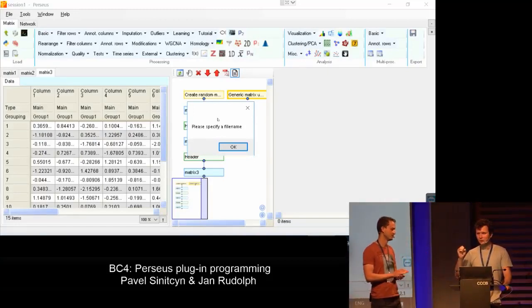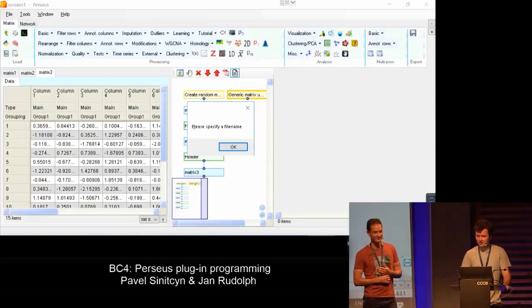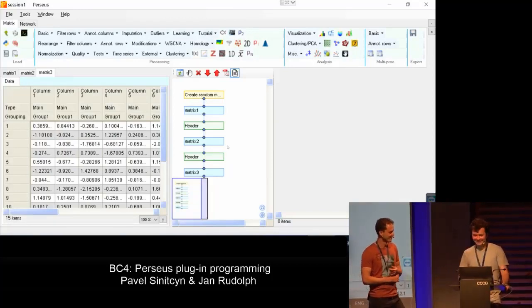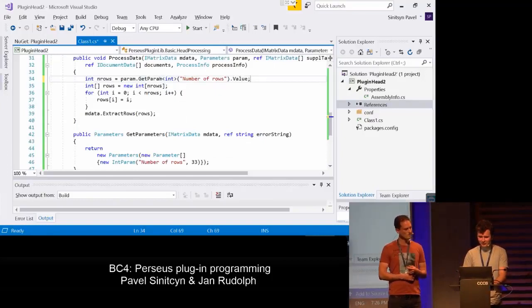So the user will start this activity without actually specifying any single file. And we wrote a really pretty nice message: Please specify a file name. And this was not an error, it was a warning. Last warning. So let's do something the same. What was the name? Wait. It was up.